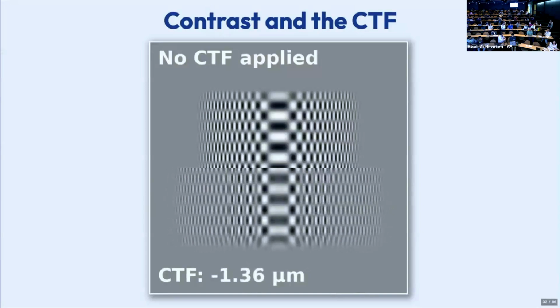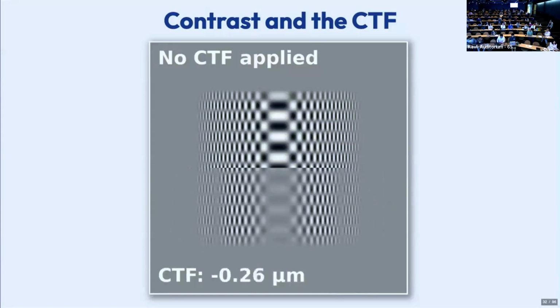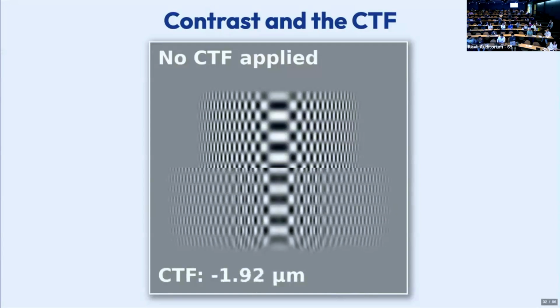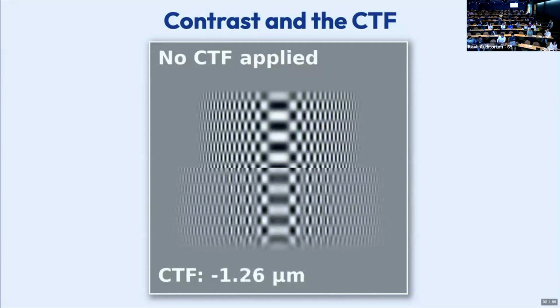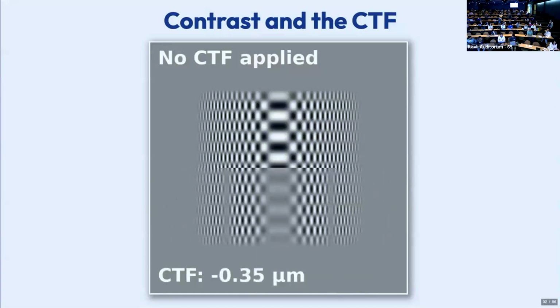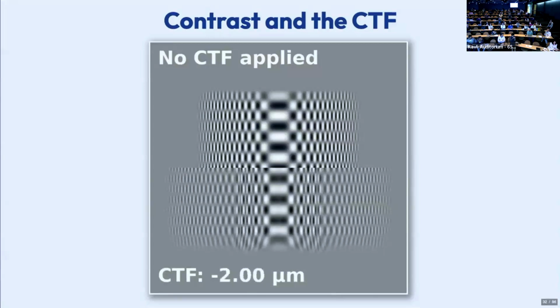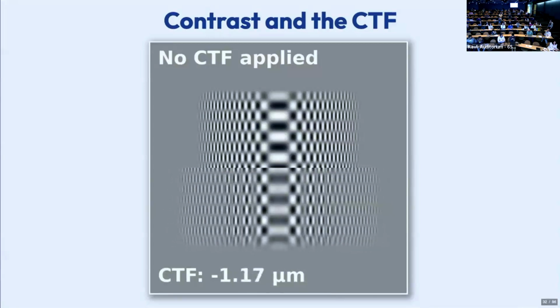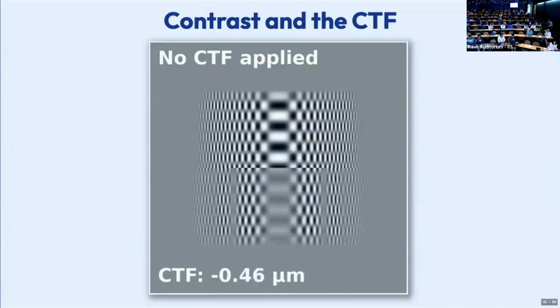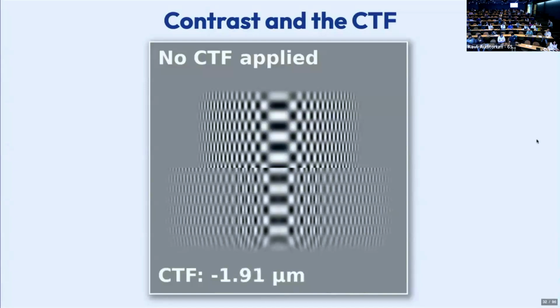But when you do the reconstructions, you may not use all the frames, but you may only use some earlier frames, which represent less damage. Now, I think there are some recent studies in the last 10 years or so that in the very beginning of the frames, so 1 or 2 frames, they're actually blurry, because the thing is moving so badly, you cannot correct it at all.